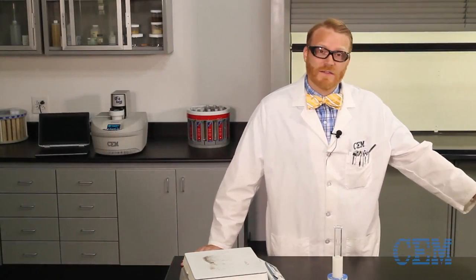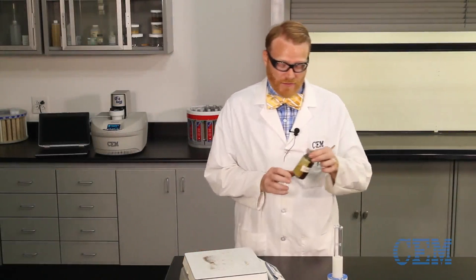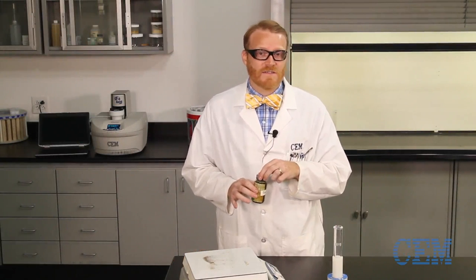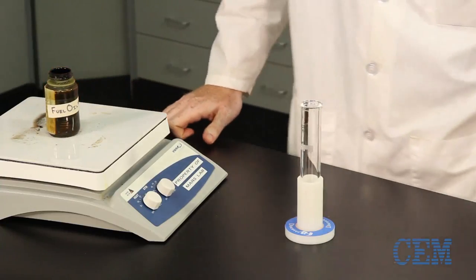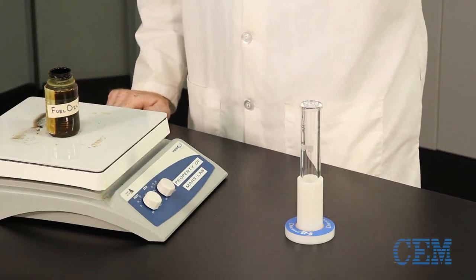I just happen to have some Bunker Oil right here. Bunker Oil is also known as Fuel Oil number 6 and it's very viscous. So what I like to do is put it on the hot plate before I pipette it to make it a little less viscous.